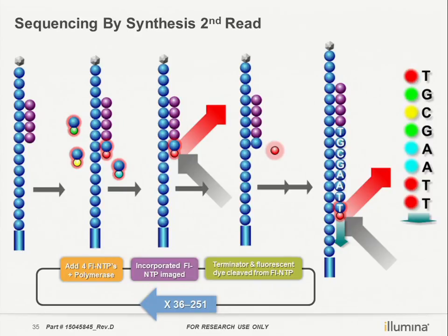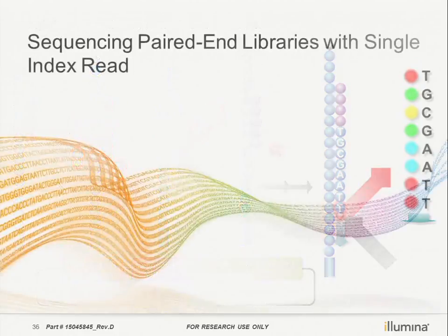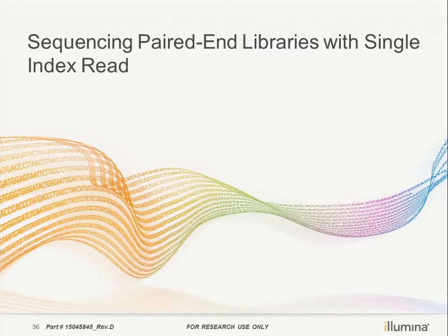So in this way, that means if this is your DNA insert, you'll have the forward that is sequenced and the reverse that is sequenced. So both ends are sequenced. That is what we call paired end. Okay. Clear with this paired end sequencing? So if this is clear, we are going to go for something a little bit more complicated.